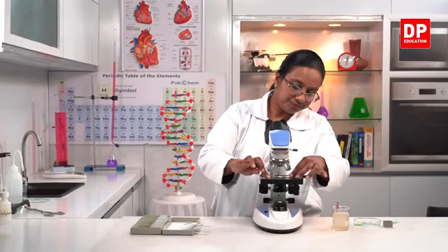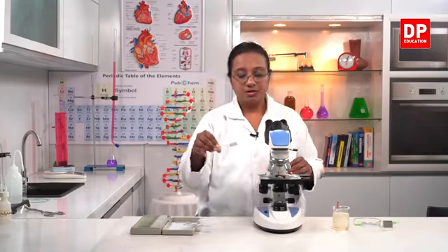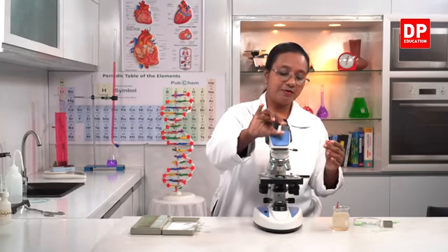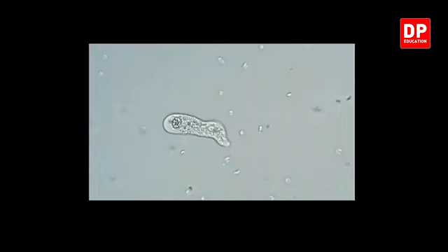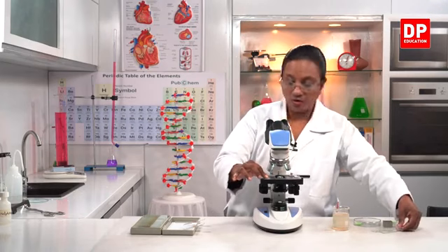Then the same way, I have already selected some unicellular organisms. There is amoeba here. That is again a permanent slide of amoeba. So that also can be observed under the microscope. Now this you all have experience observing before also. Okay. So can you all see that clearly, students? That is again a unicellular organization. Just one cell, that is a living organism. So we are discussing the organizational levels of living organisms.